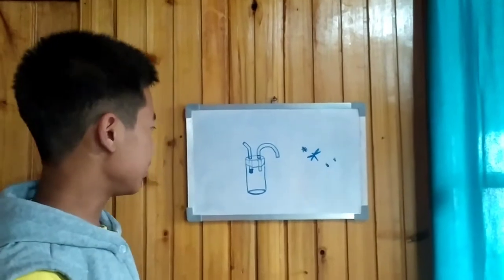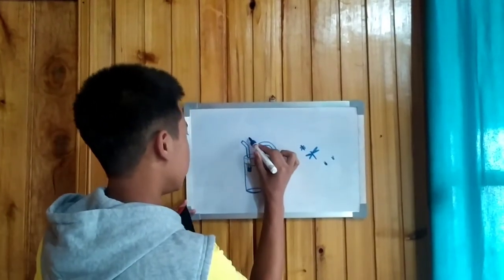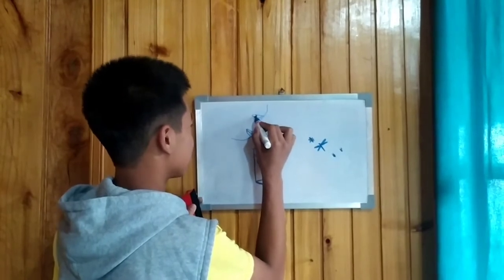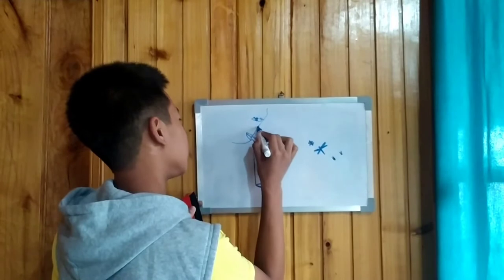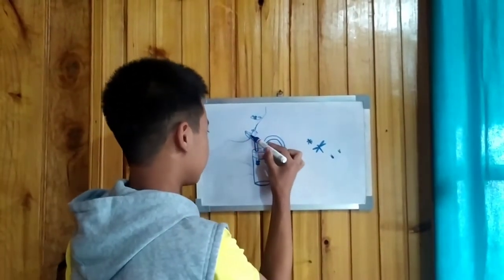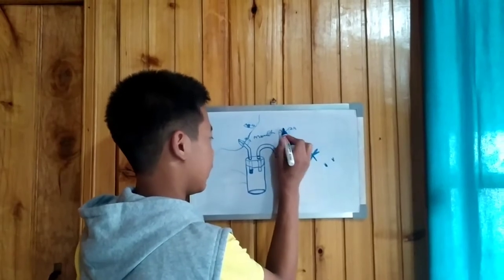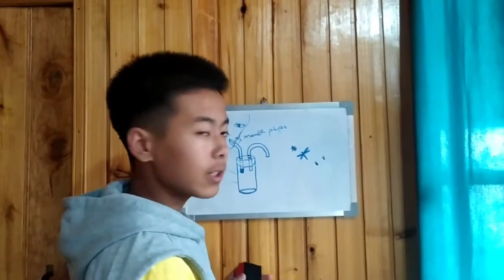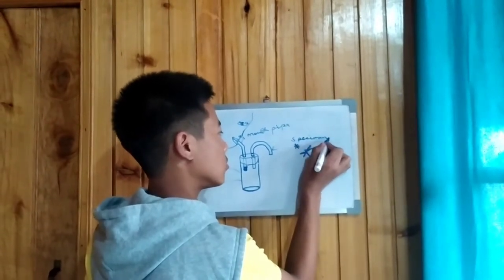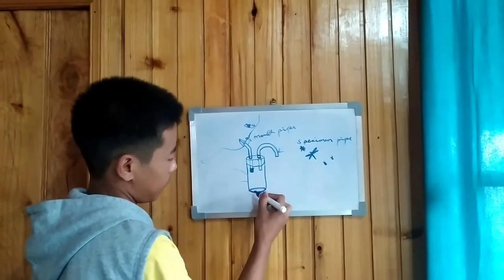As you can see, I've made a structure of an aspirator. An aspirator has two pipes. One is for the mouth, where you join your buccal cavity — suppose this is me holding this. One pipe is for the buccal cavity, your mouth, and let's label it the mouth pipe. Another pipe is for catching the specimens or the insects, so let's call it the specimen pipe. Your aspirator has two pipes with a hollow space inside, under which the insects can fall.